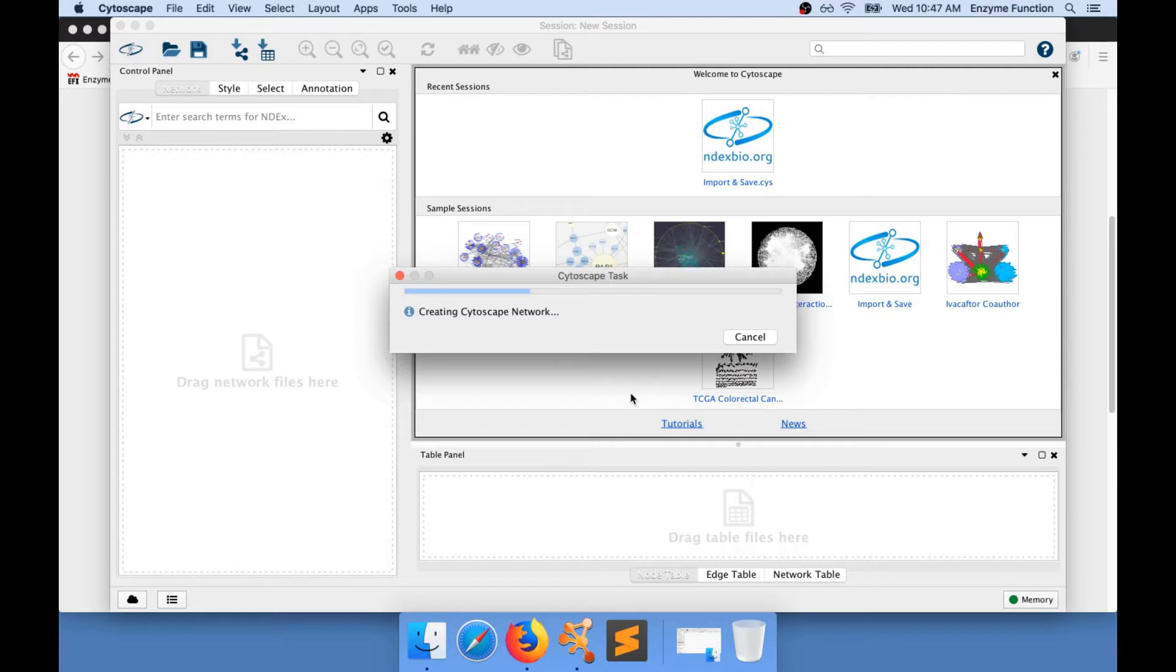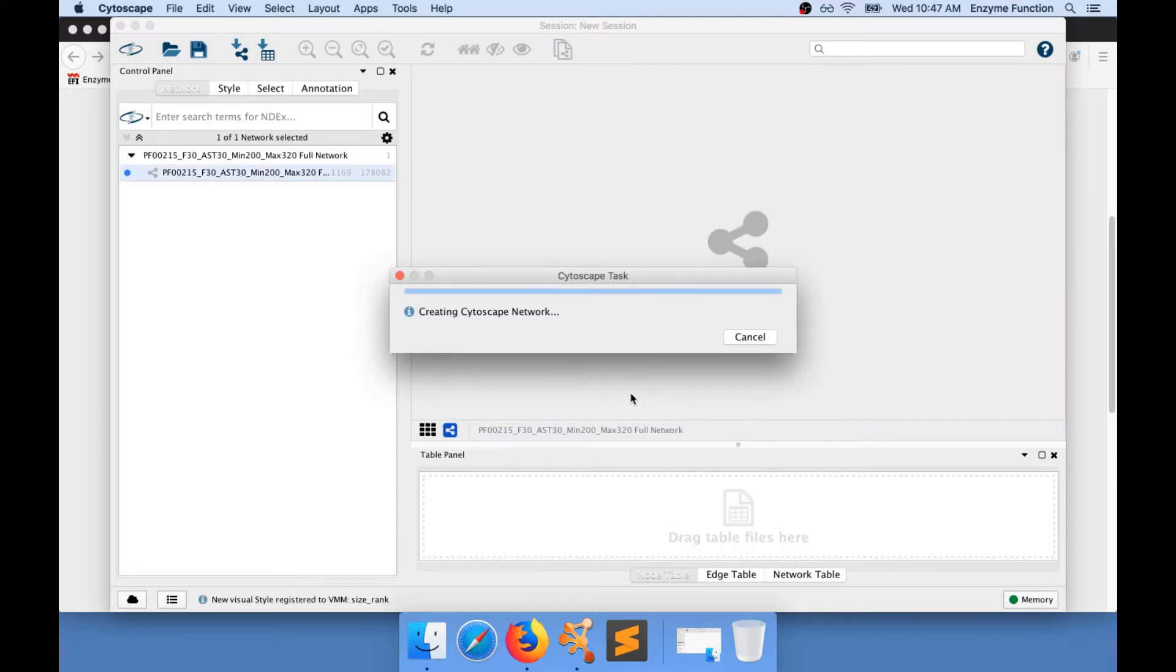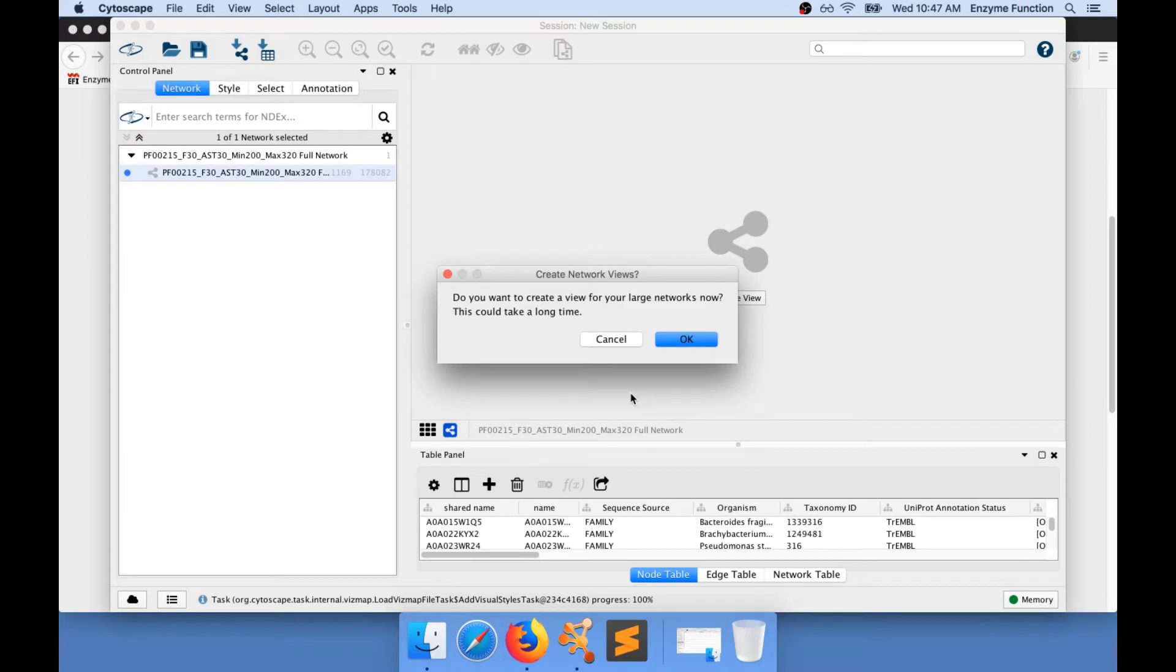The network is being loaded into Cytoscape. Once I have my network loaded, I need to create a view for my network.